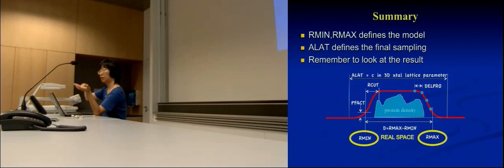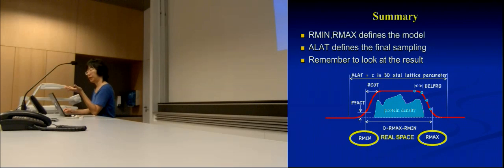So for P6, the origin is defined at the 6-fold axis. If this is a P1, it can be anywhere because it doesn't need to do anything. It just needs to make sure it repeats in the same way. So if you have higher symmetry, you need to first merge it to its proper origin. Otherwise, your phase values are still going to look wrong. They can't do that inversion correctly I was talking about.